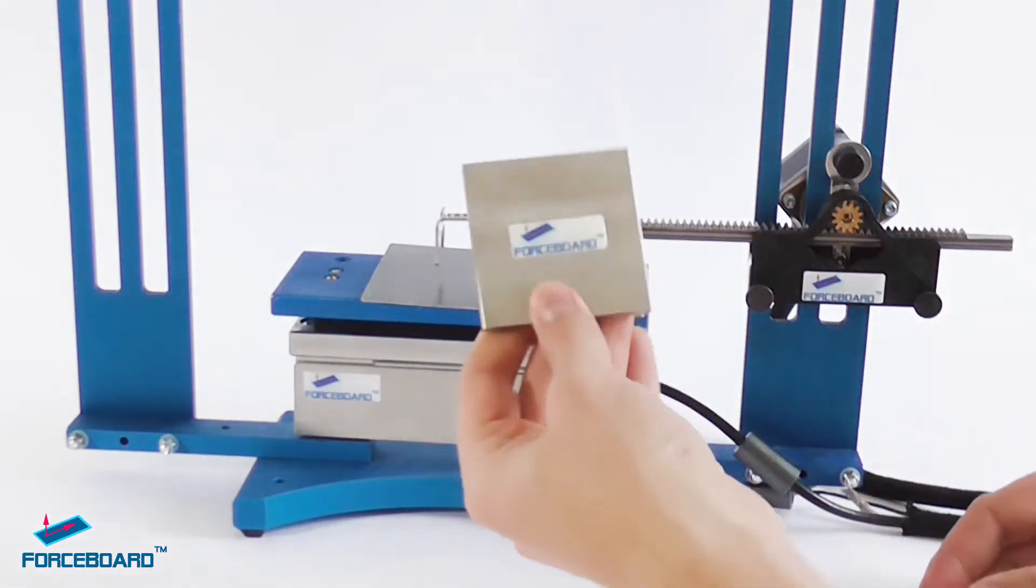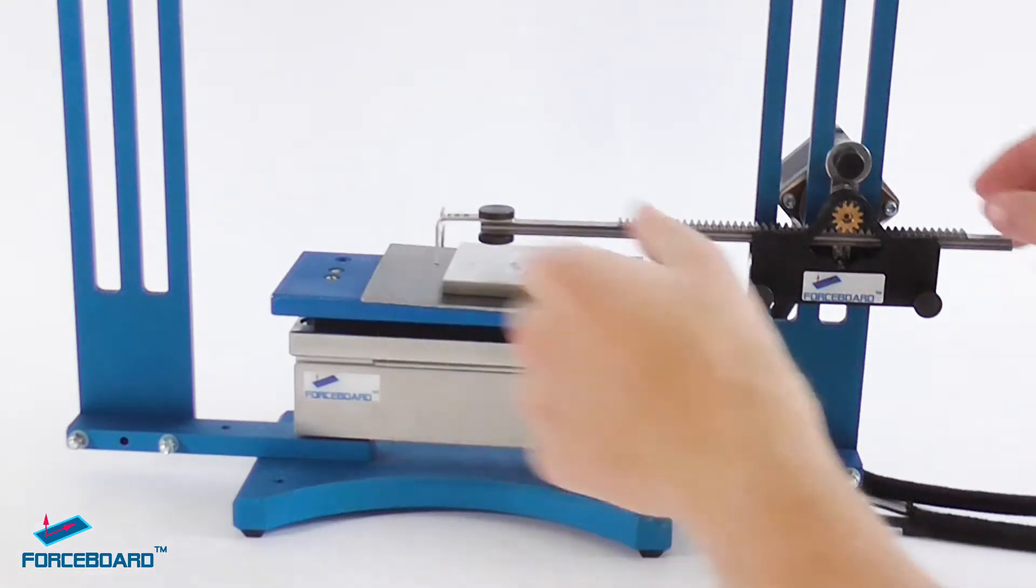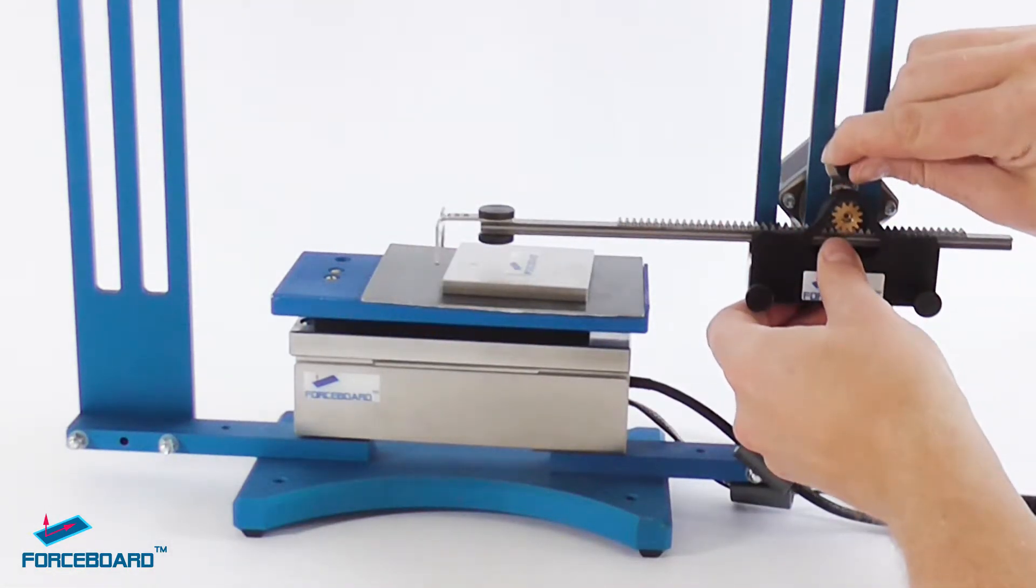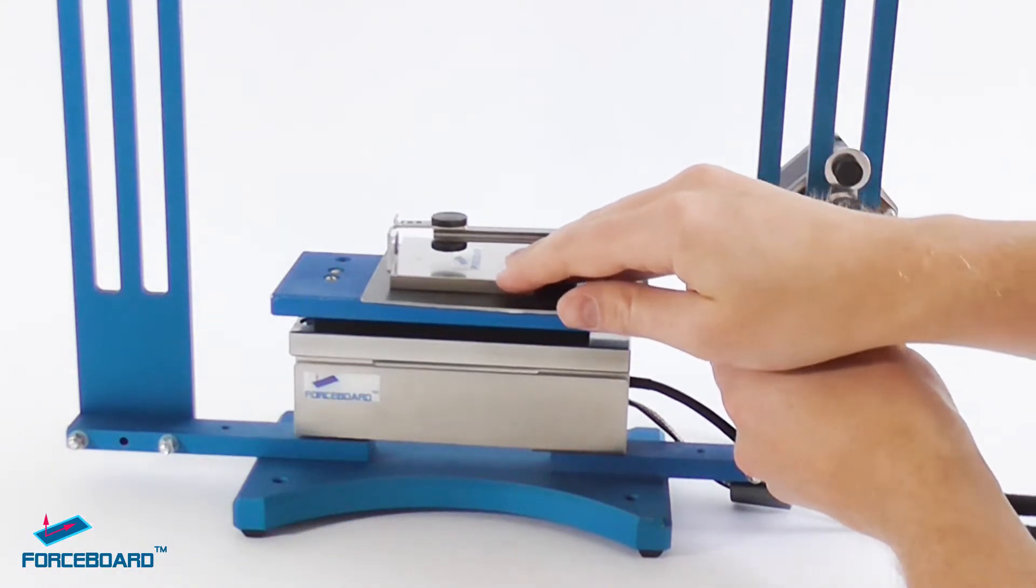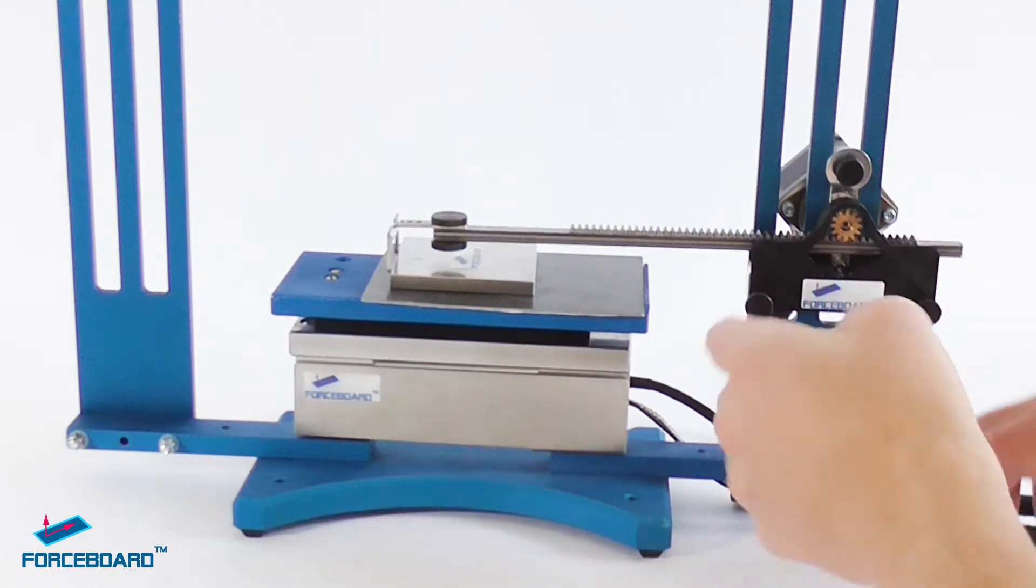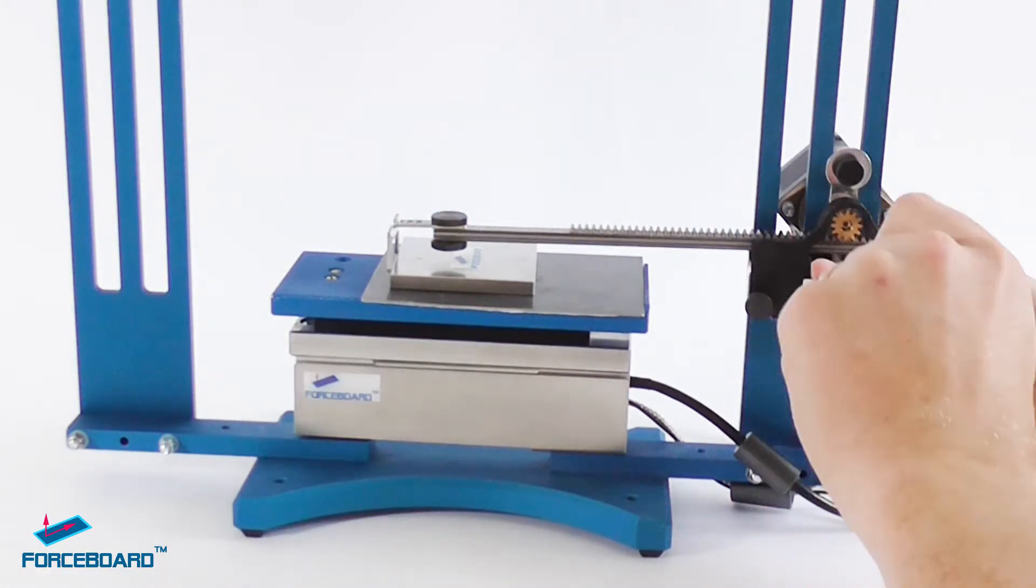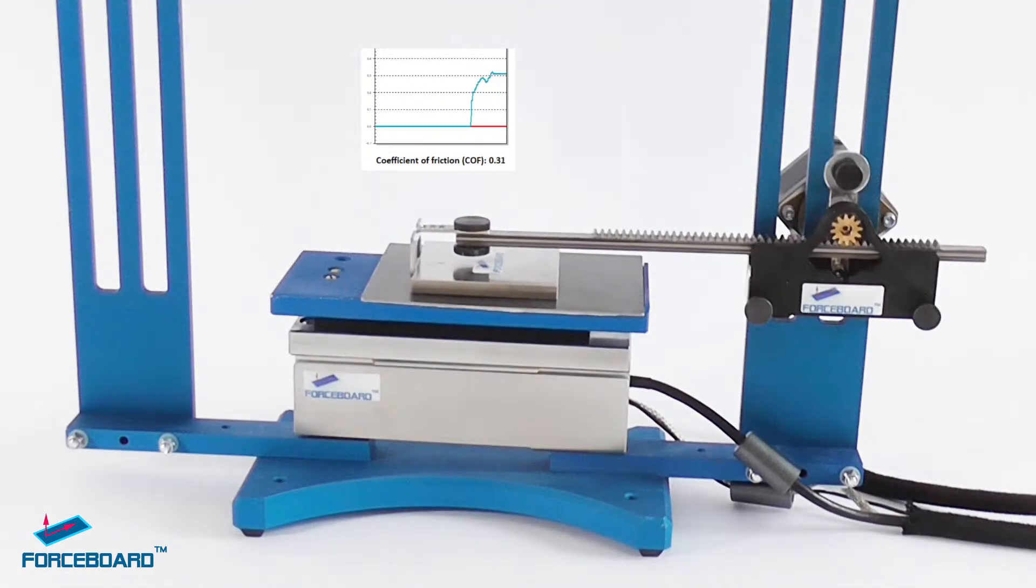We bring the metal plate into the correct position and tighten the screws to the assembly, and then we measure the coefficient of friction. That's it.